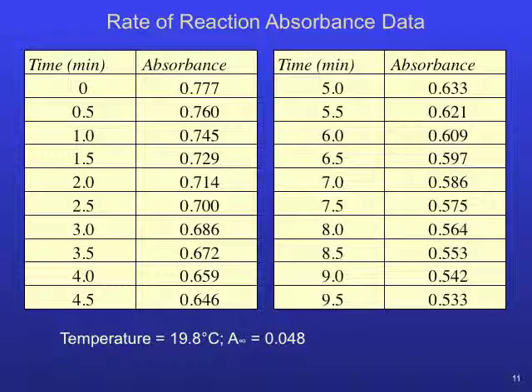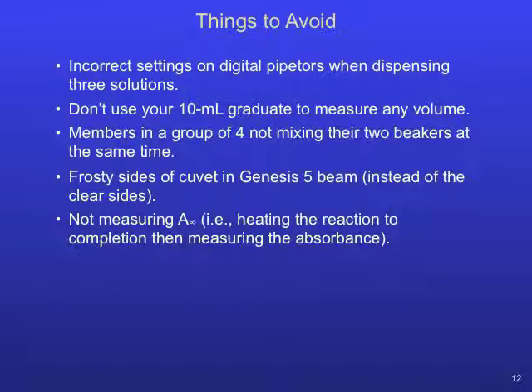Here is a set of representative data collected at 30-second intervals for just under 10 minutes. Note that the absorbance decreases with time, which is quite typical of the concentration of a reactant as it decreases while the reaction progresses. There are several pitfalls to avoid in this experiment.